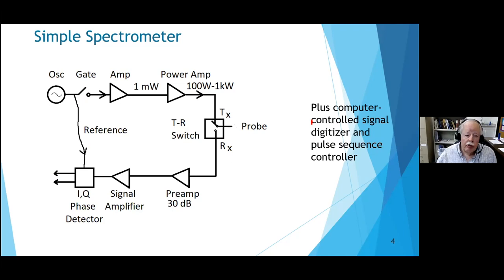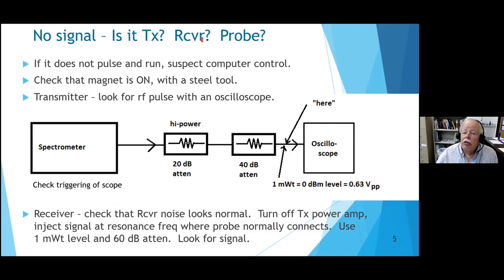If something goes wrong, your first question is: transmitter? Receiver? Probe? If it doesn't pulse and just sits there like a lump of cold spaghetti, suspect the computer control. I can provide no guidance on that. You might check that the magnet is on - it almost always is, but you never know; it could have quenched. If you hold a wrench in two hands about three feet away, you can feel a torque and small force confirming the magnet still has current.